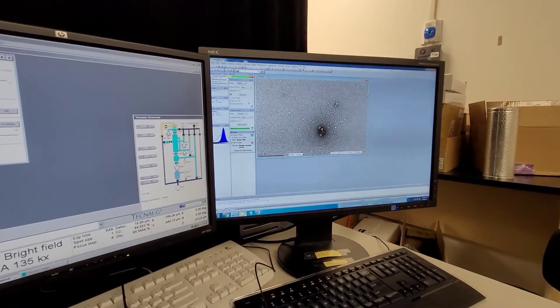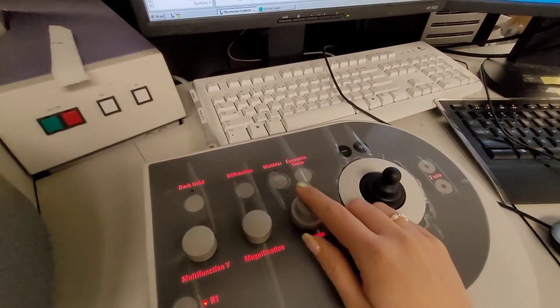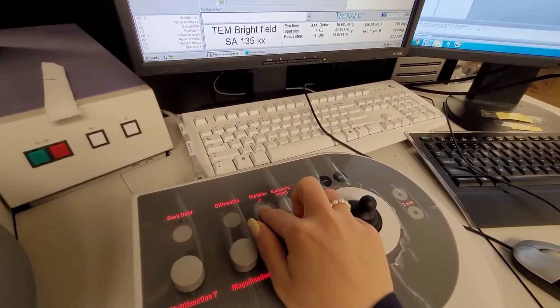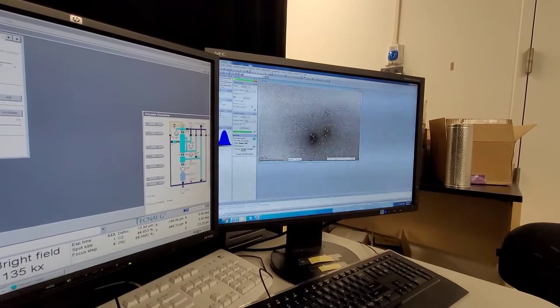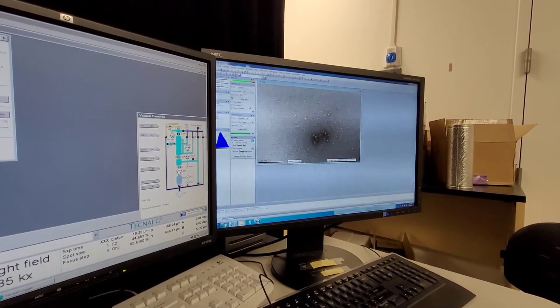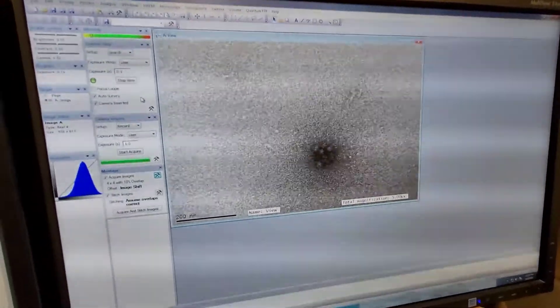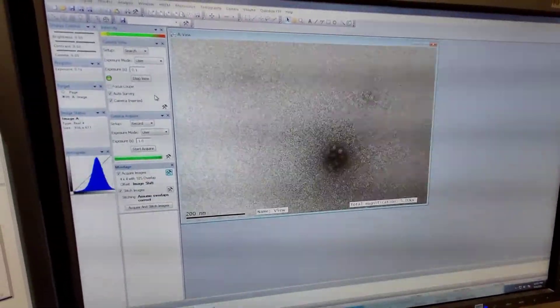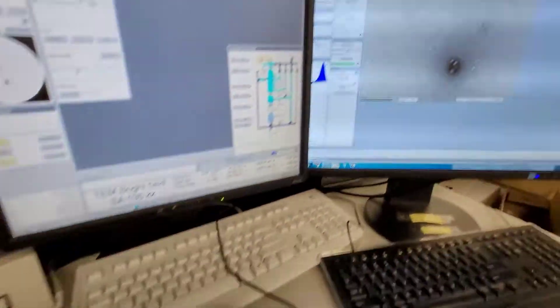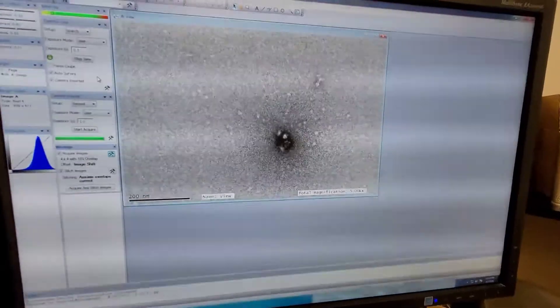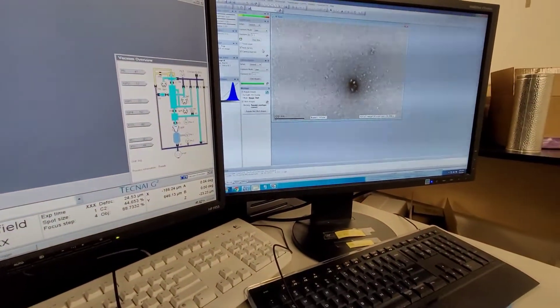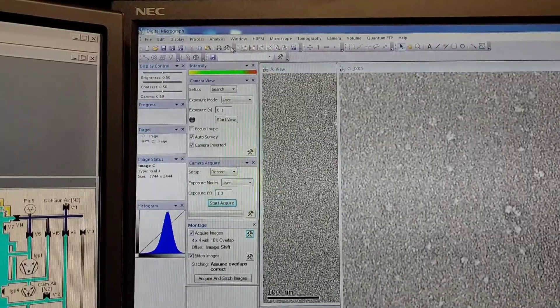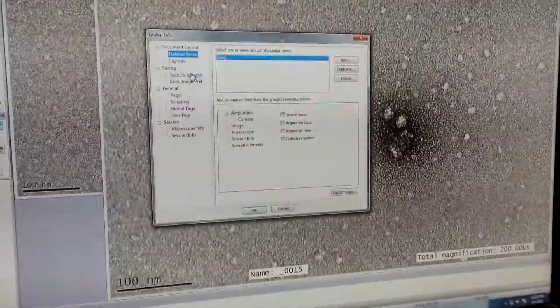To do the focusing correctly, I use the wobbler. Once you push the wobbler button, your image is going to look like two, and then you have to turn the focus knob until they become one. Once that's done, you can select the wobbler again to turn it off, and then you will have a nice focused image.